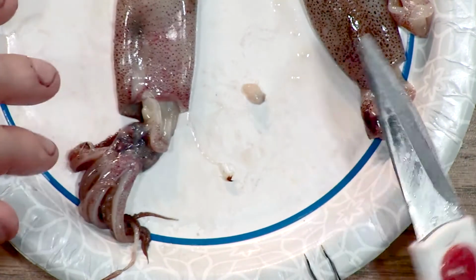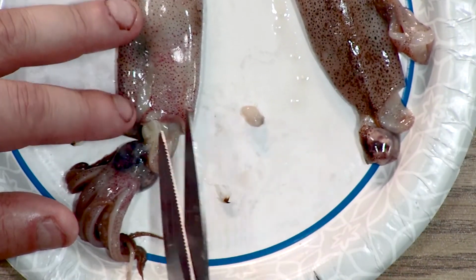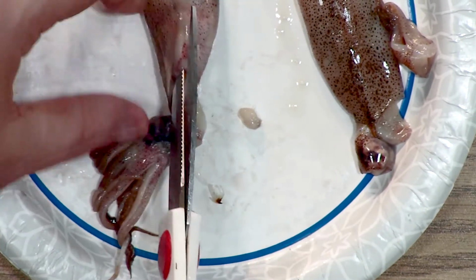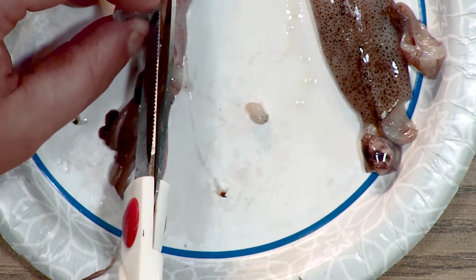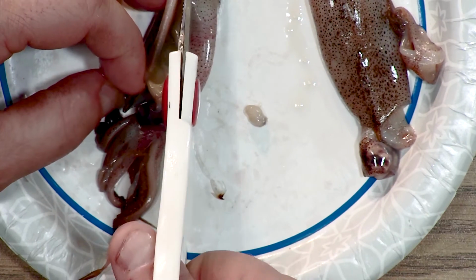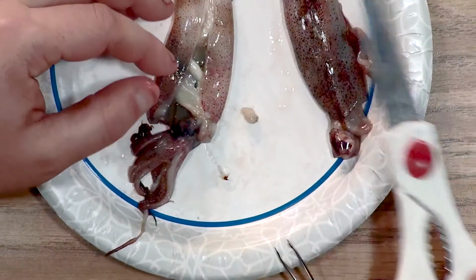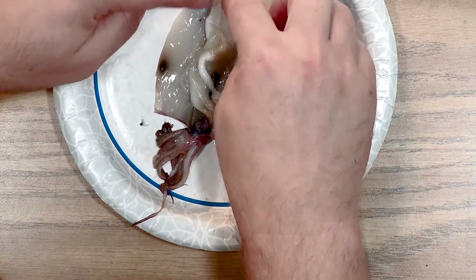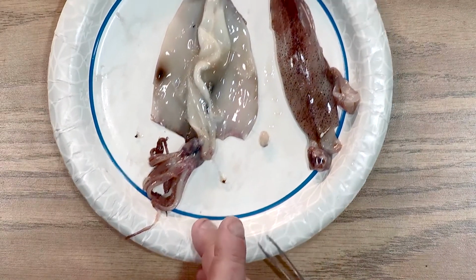So like I said, you want to look at the bottom, which is the lighter colored side. And I'm going to go ahead and take my scissors here and put them inside and make sure that there's some spacing there. And I'm just going to cut all the way down to the tip. All right. Now, there's quite a few organs in this that are so small that we're not going to be able to even see them inside. But we do have a pretty good look at several things in here.